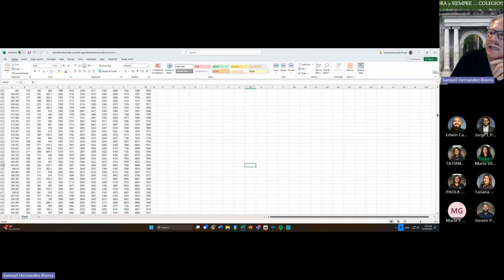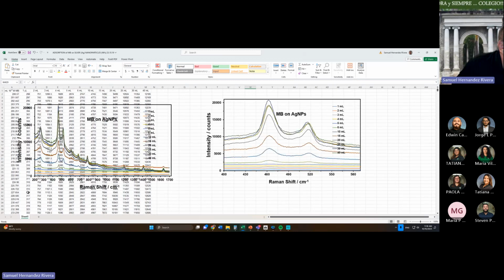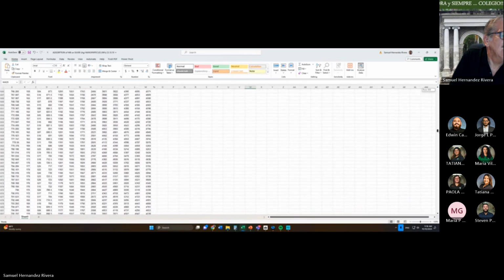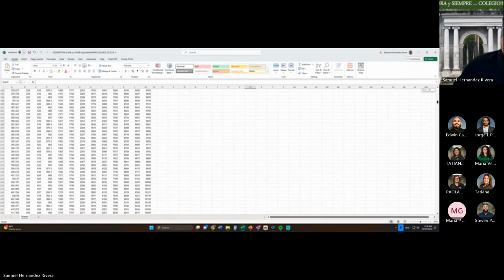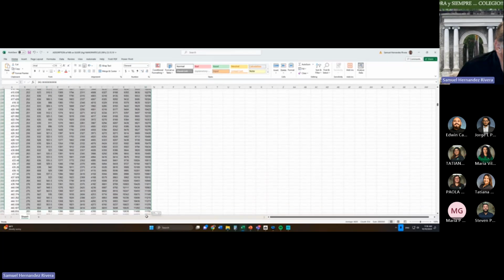I don't need the x-axis. Let's start again. So go from here. To 590.